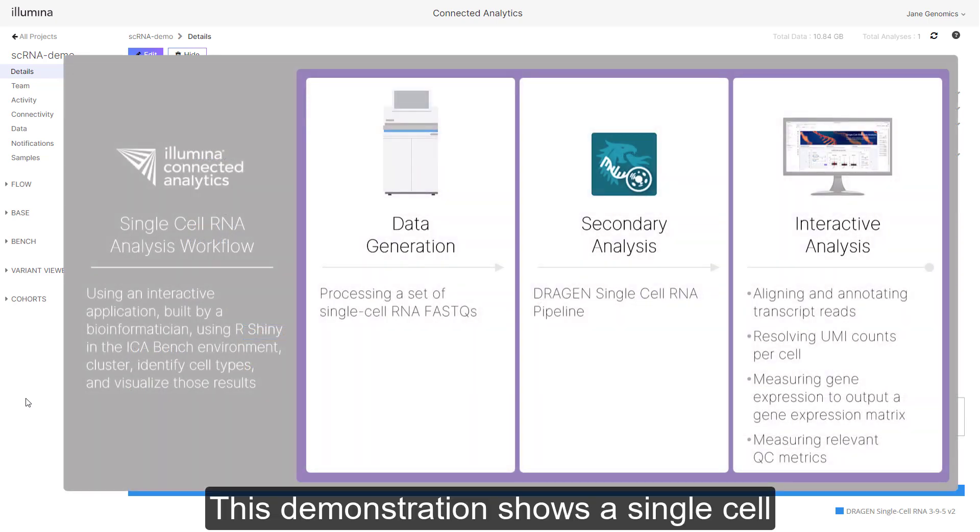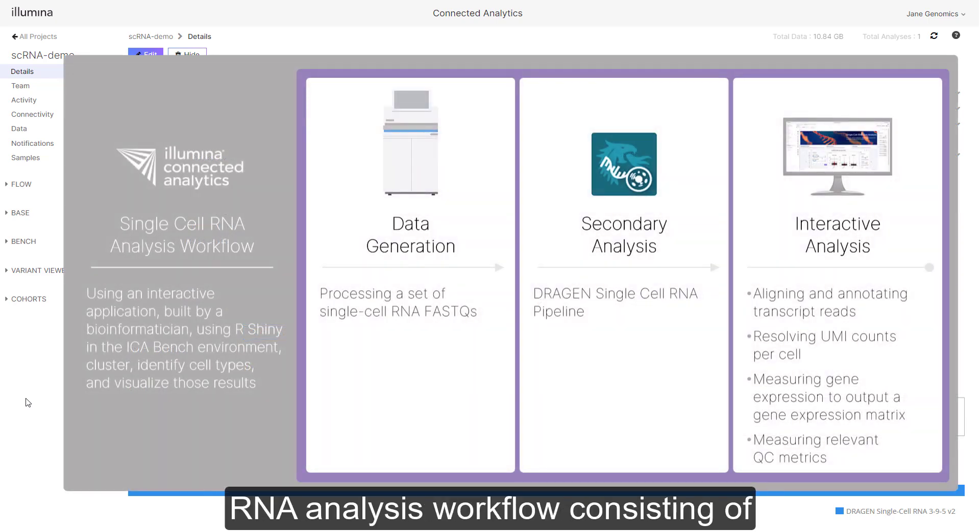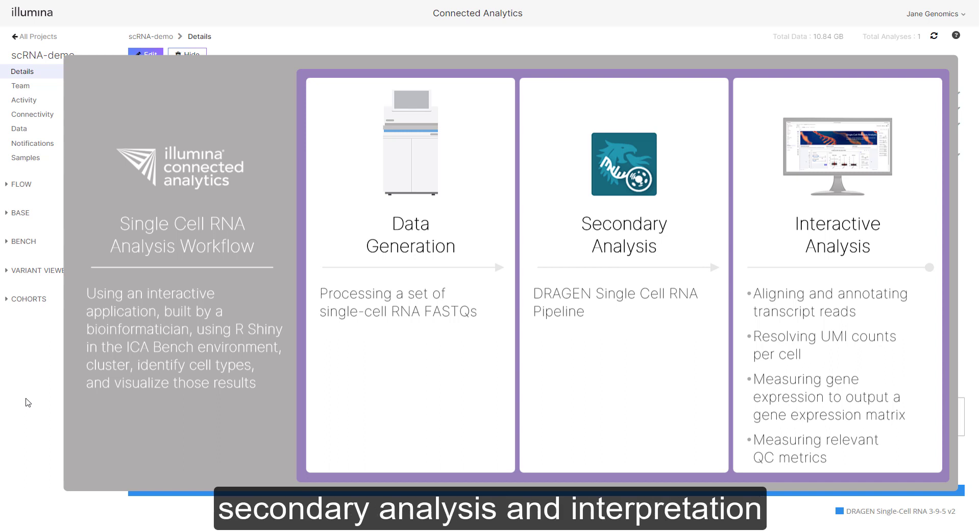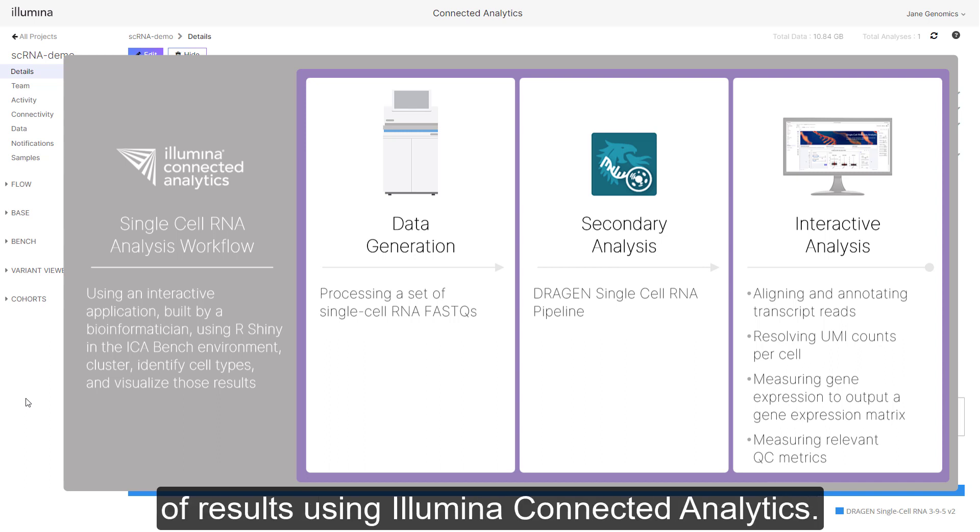This demonstration shows a single cell RNA analysis workflow consisting of secondary analysis and interpretation of results using Illumina Connected Analytics.